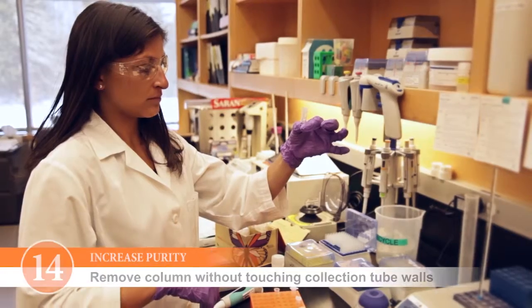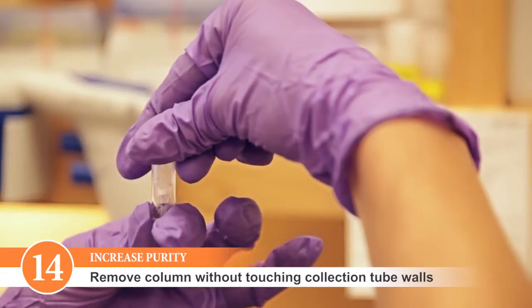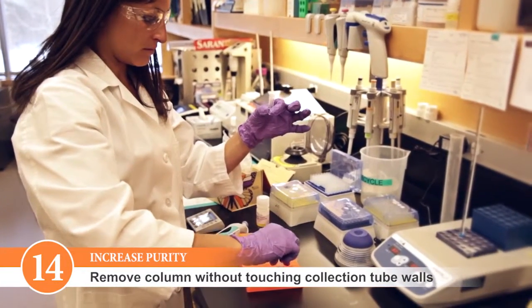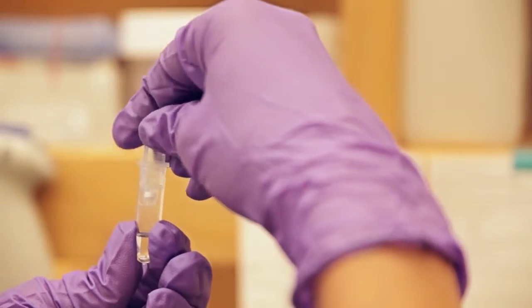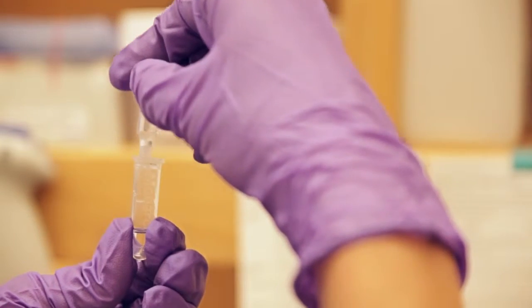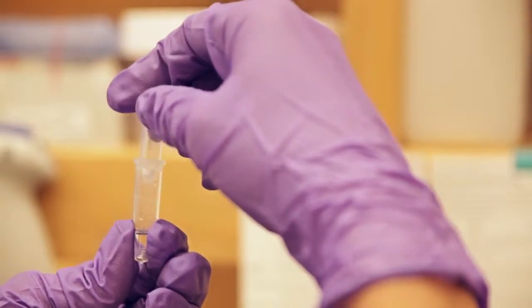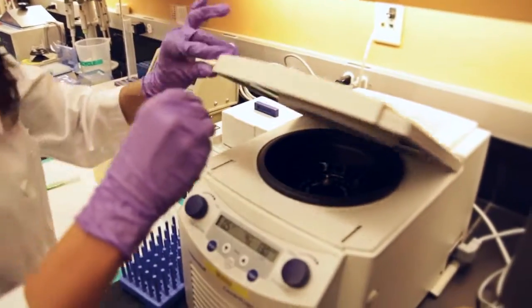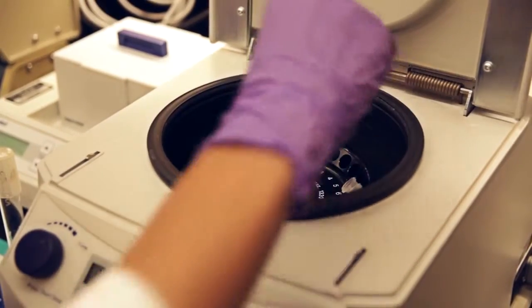When removing the column from the collection tube after the last wash, make sure that the tip of the column does not touch the walls of the collection tube. If the tip of the column did come into contact with the collection tube, then we would recommend an additional 30-second centrifugation step prior to placing the column in the 1.5 mL microcentrifuge tube for elution.